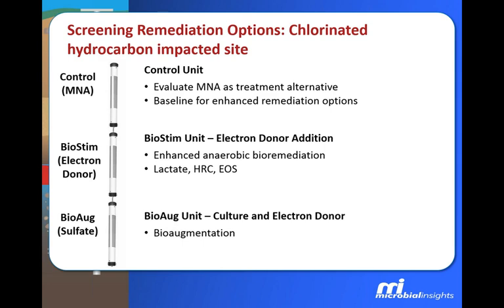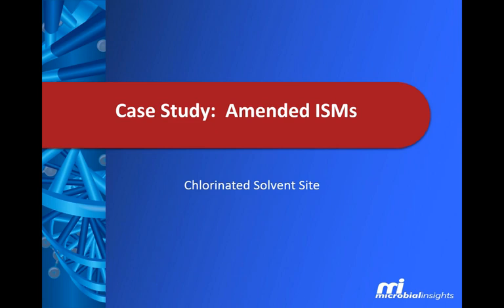And one thing that I should point out about these in situ microcosms and these electron donors that are present, these are very small amounts of electron donors. They're meant to change the environment on the inside of these in situ microcosms. After incubation, there's very little or none of this electron donor that's actually left. There is no lasting effect of that electron donor, especially after any subsequent purging when the well is being resampled.